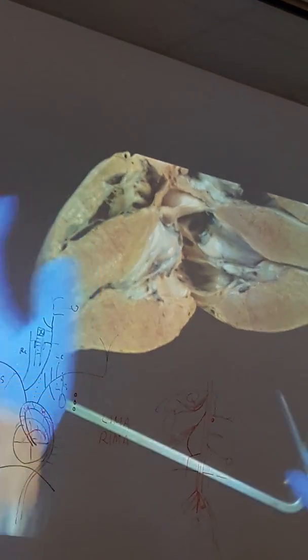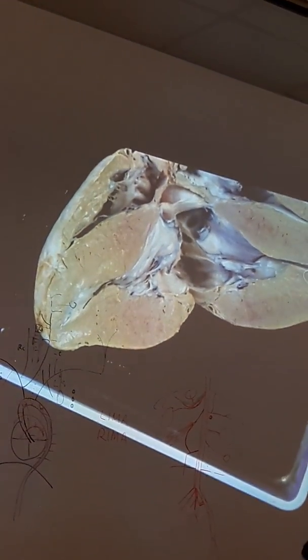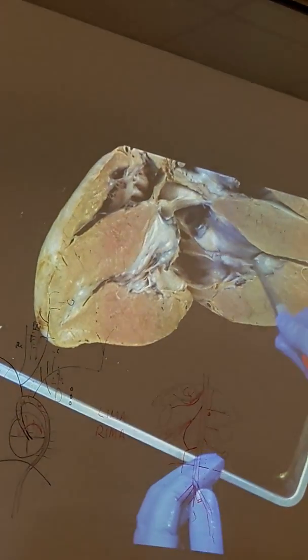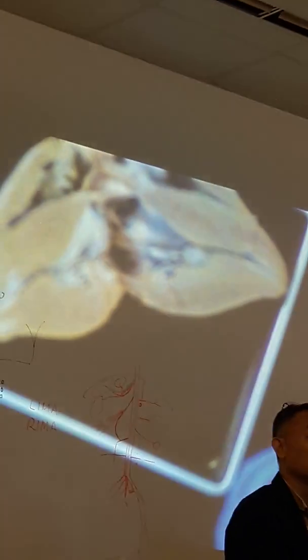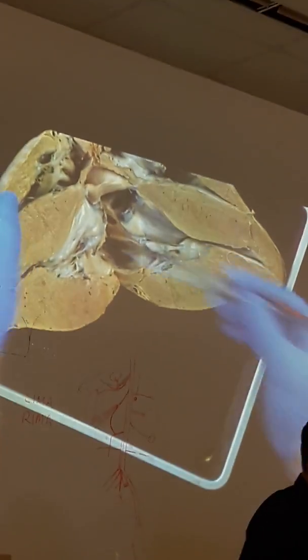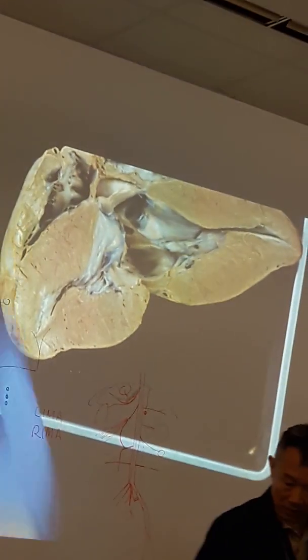So it is to prevent overstretch of the chamber. It's the raised bundle of the cardiac muscle. It's a muscle. This chordae tendineae is connective tissue. Totally different. Okay, location different, and the looks different. You see. Okay.